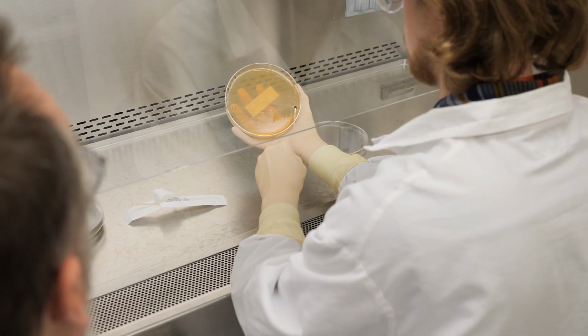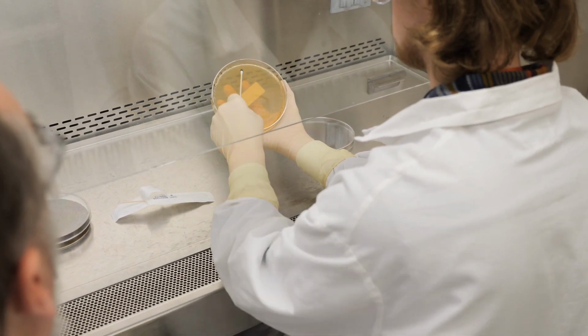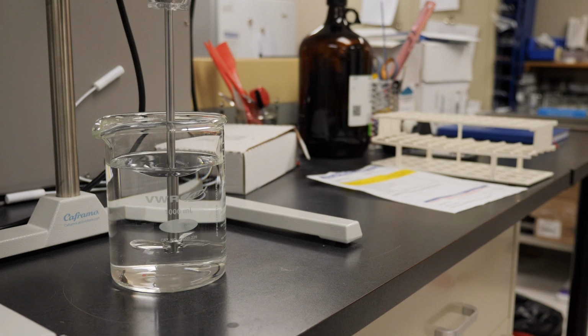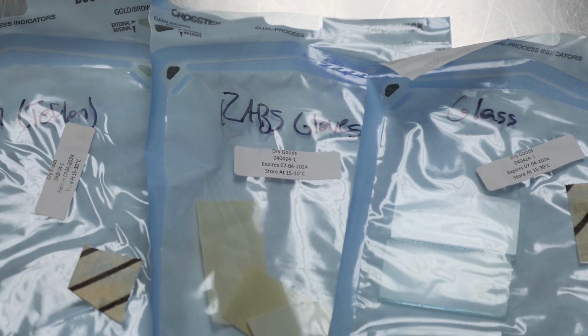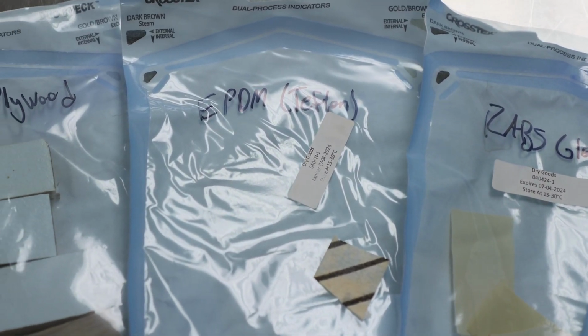Each manufacturer of the disinfectants and cleaners has to validate that the cleaner works itself against a certain level of organism, whether it's molds, yeasts, or bacteria, or viruses. However, you still have to make sure that the surfaces that you have in your facility do not interfere with the disinfectants working against the different organisms.